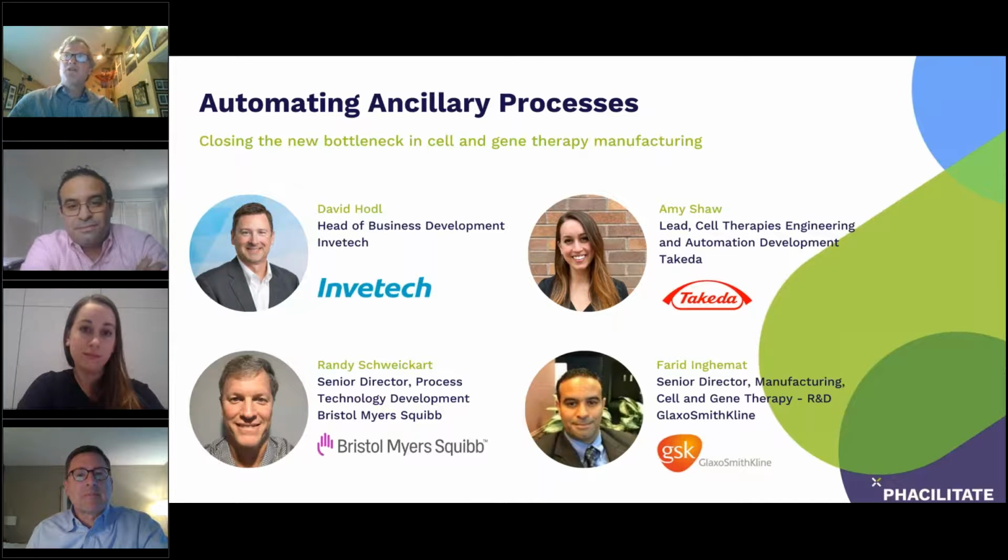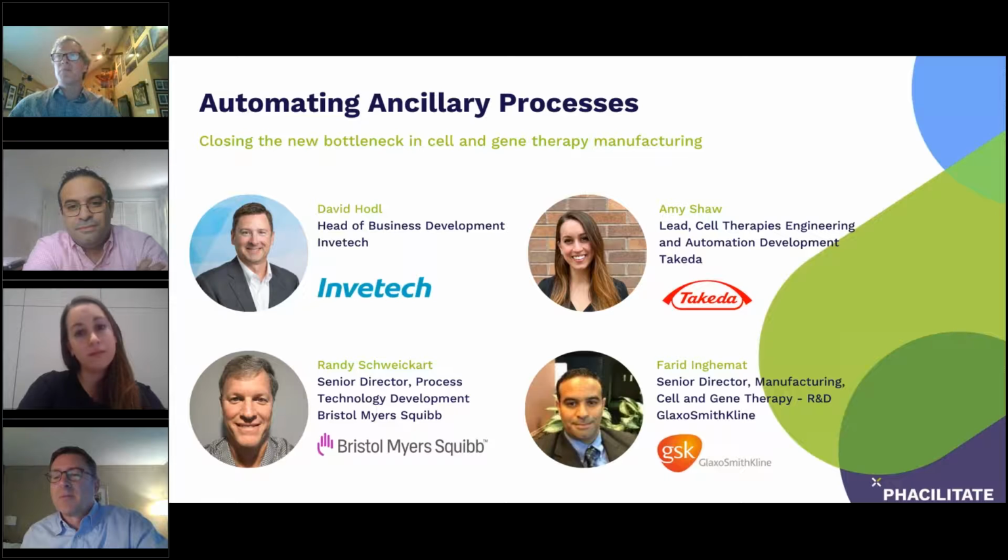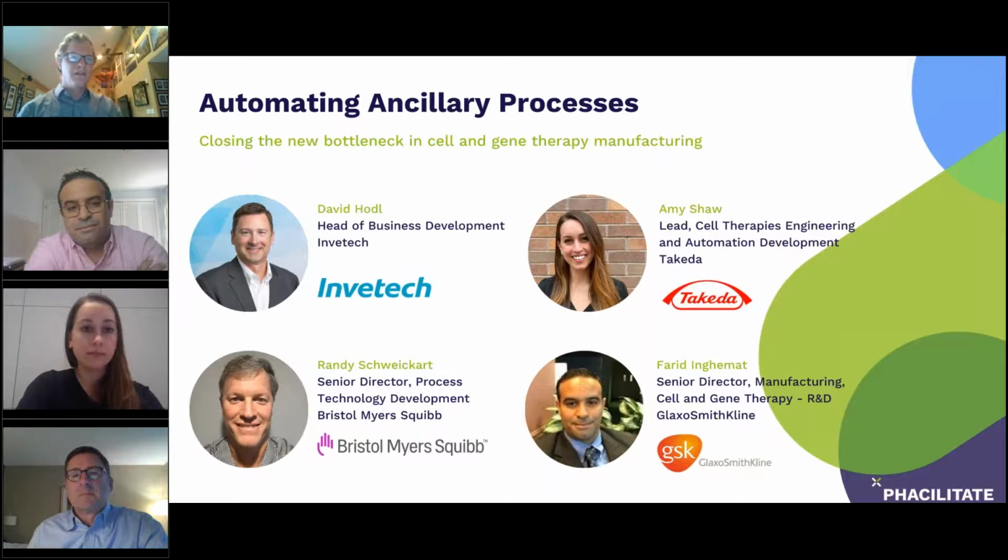Okay, I'm going to assume that we're talking autologous. I don't know from the question whether that's really true. Let's just start with the not. If we're talking about allogeneic and so forth, then I think the strategies that you have are not too significantly different than you have in the protein industry, right? You have to understand the scaling of your bioreactor, the scaling of your downstream systems and so forth for larger scale processing. So I'll just leave it at that for the allogeneic space.